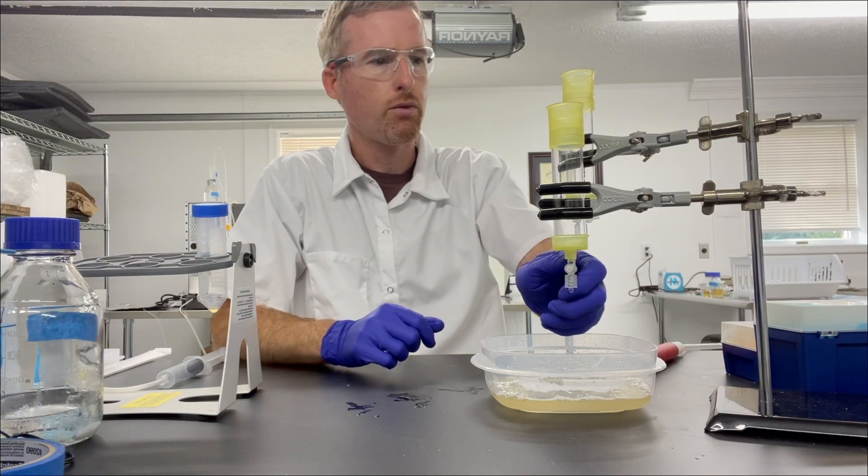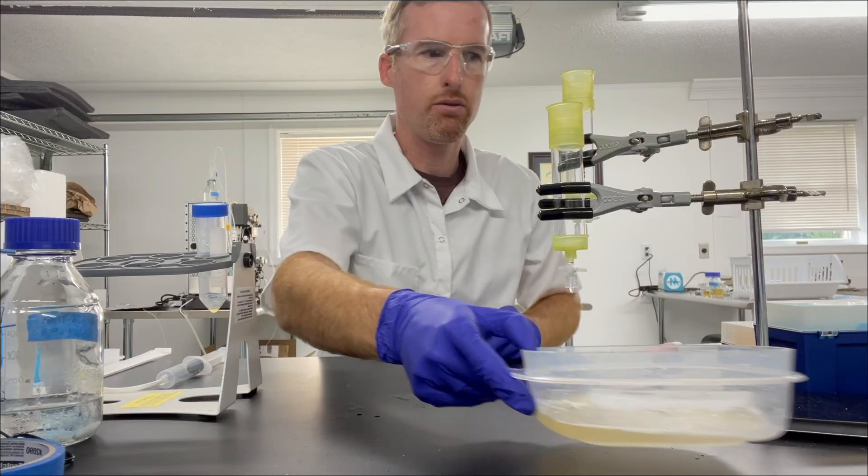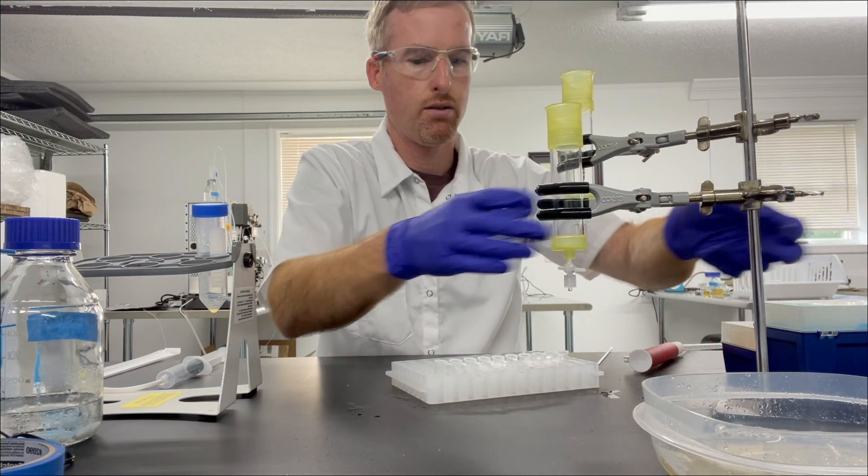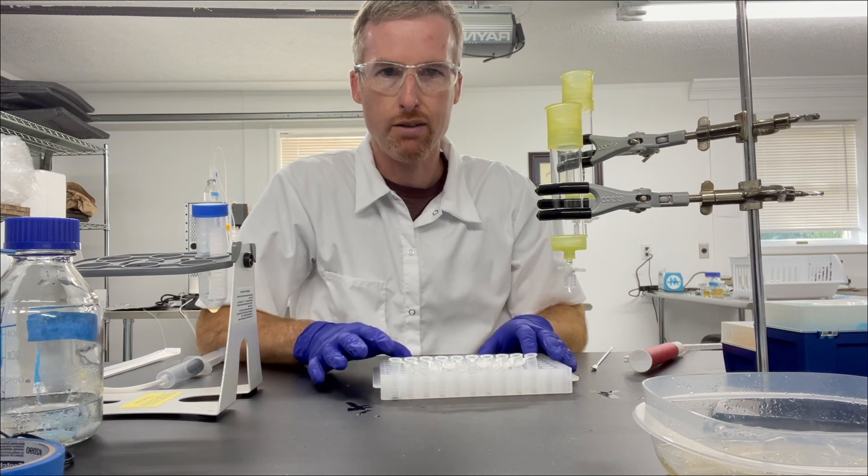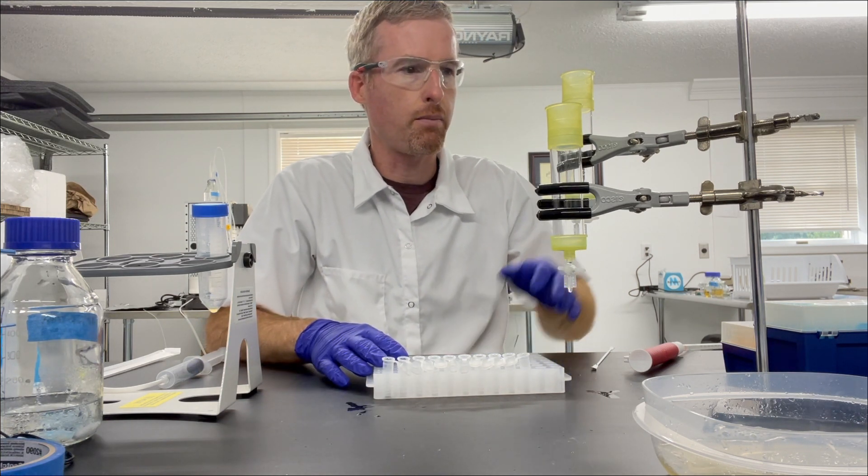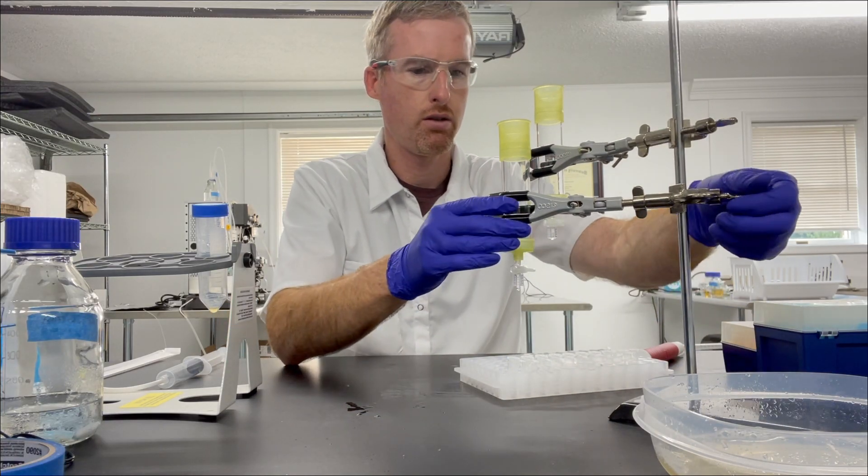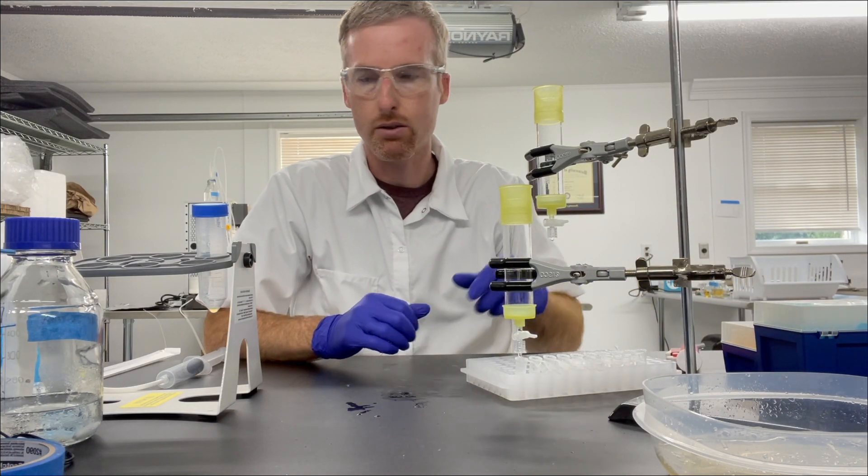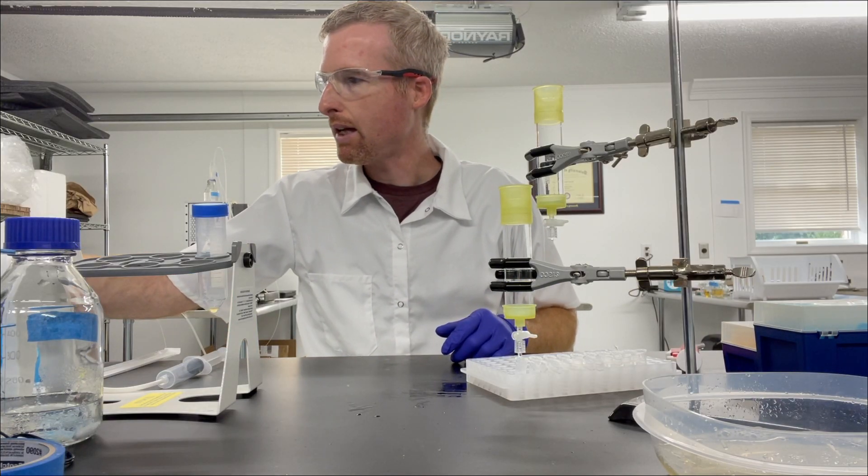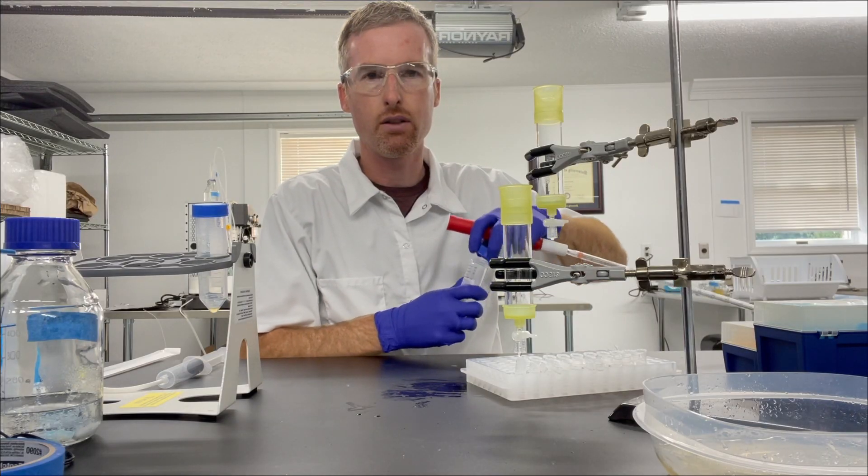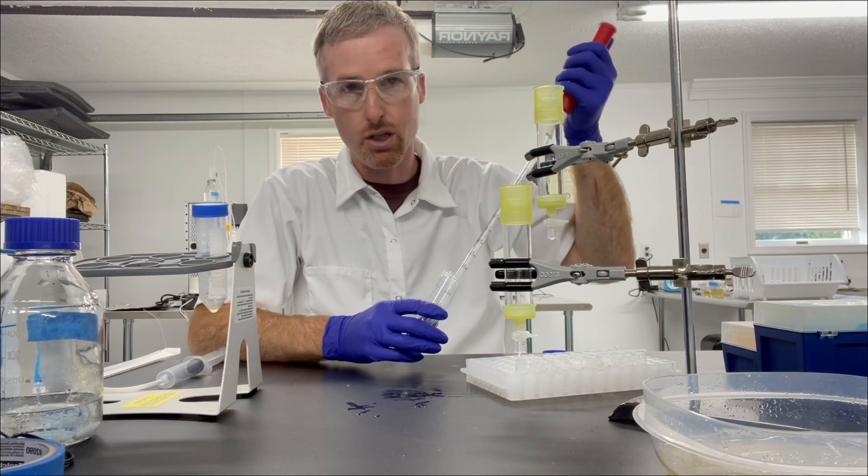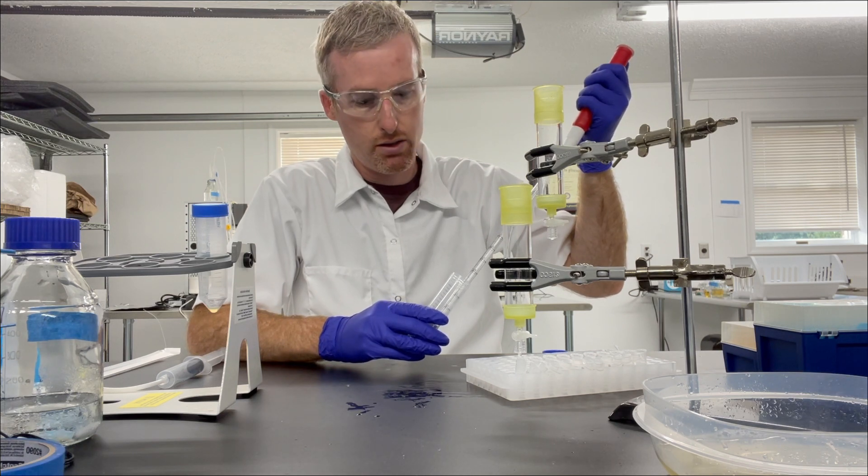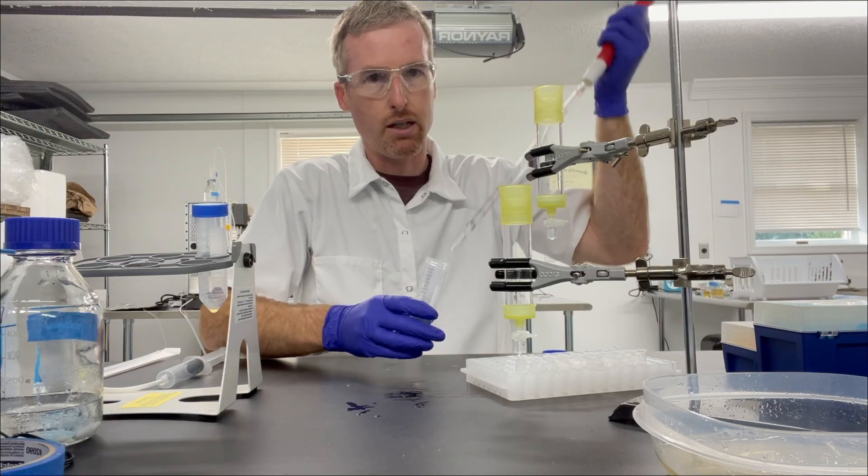And now what I'm going to do is elute the protein. So I have here 10 1.5 ml microfuge tubes, they're labeled 1 to 10, and I'm going to lower the Econo column down until it's right above the tube, turn the stopcock so it's off, and then I'm going to add one milliliter of elution buffer. So elution buffer is just the same as wash buffer except that it has 250 millimolar imidazole added and it's pH'd to pH 8. I'm going to add just one milliliter of elution buffer.